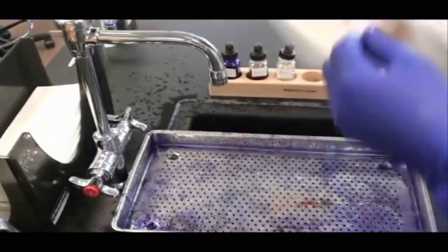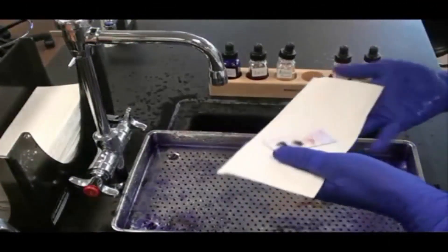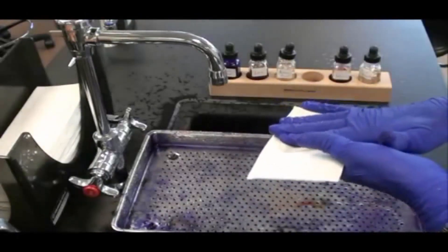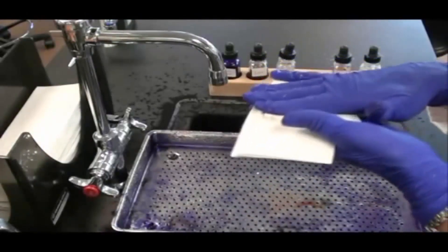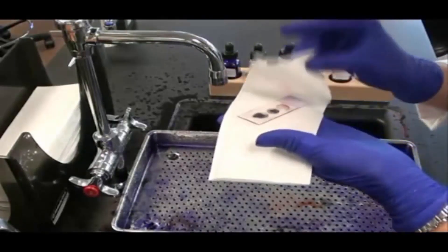I want to gently blot this slide dry — don't wipe it. You could wipe the bacterial smears off. So gently blot and then you'll be ready to look at that slide through the scope under oil immersion.